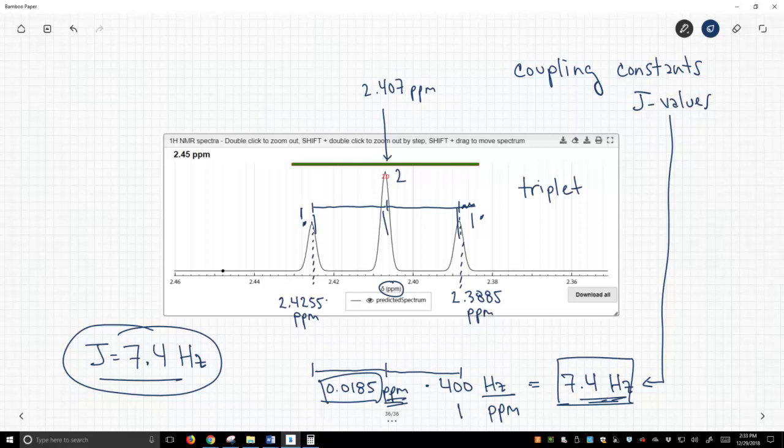And it's a way to report, here's what my spectrum looks like. I got a triplet. The triplet should have a J-value of 7.4. If you make the same molecule and you take the NMR, you should also get a triplet with a J-value of 7.4 hertz. So, this is a very characteristic value that relates to the properties of the molecules we make, and it's a very useful way to communicate structural features when we talk about NMR data.